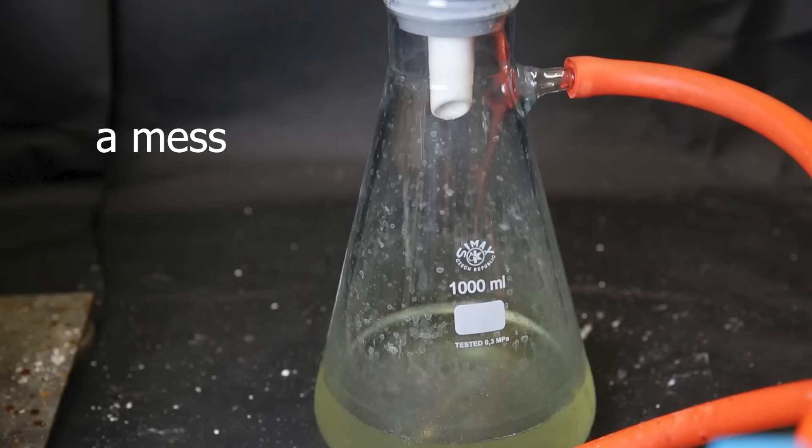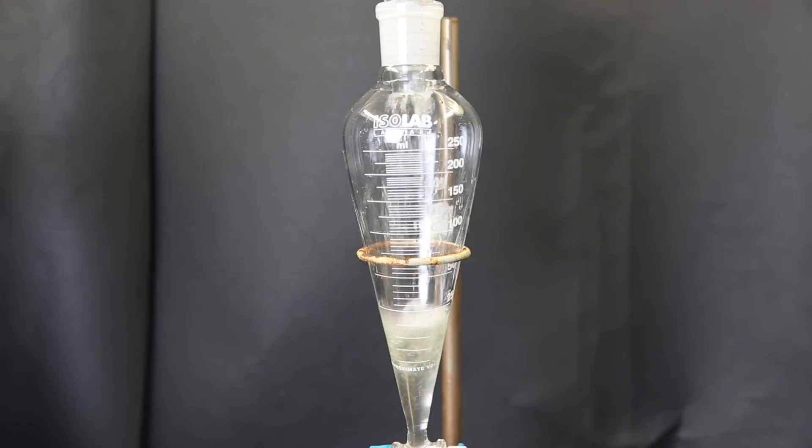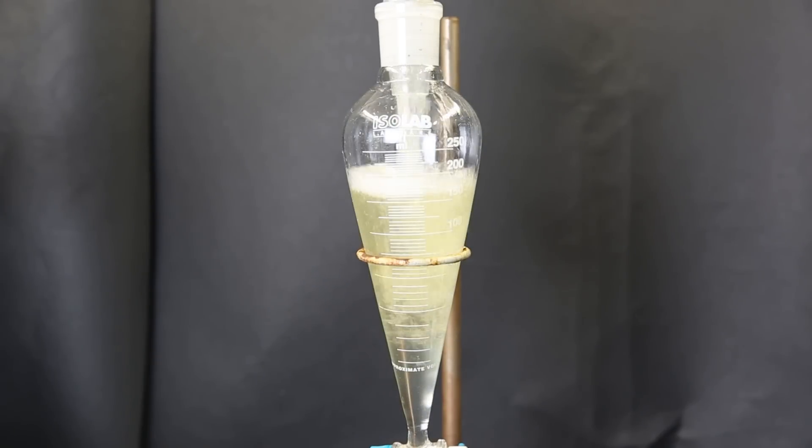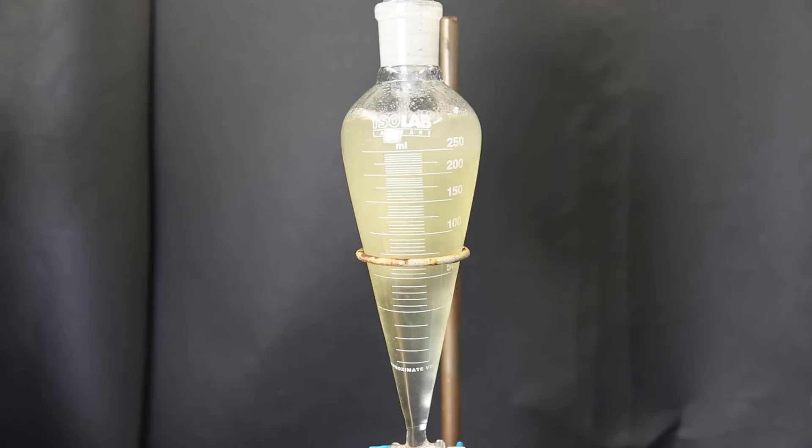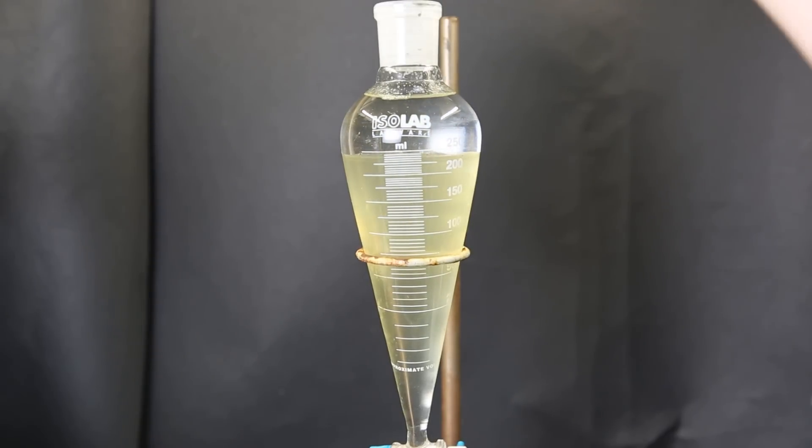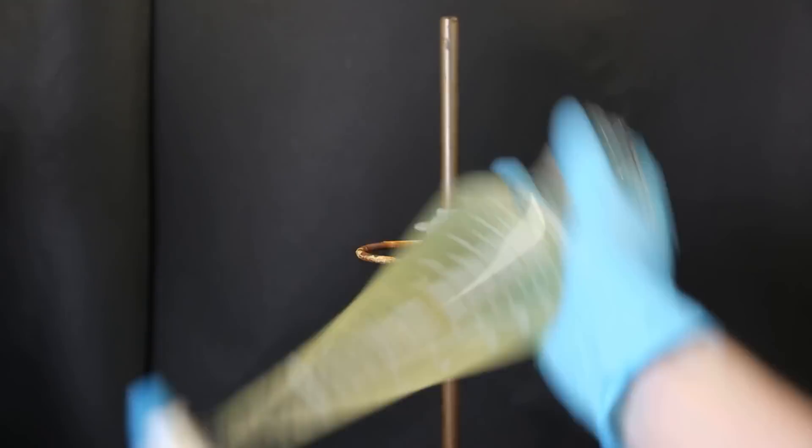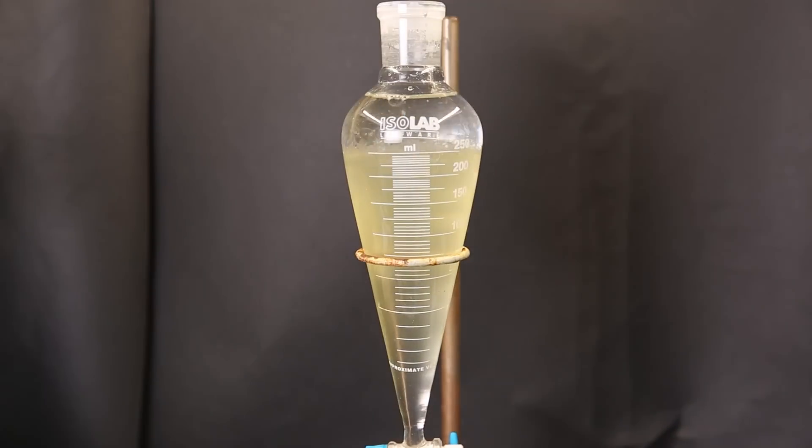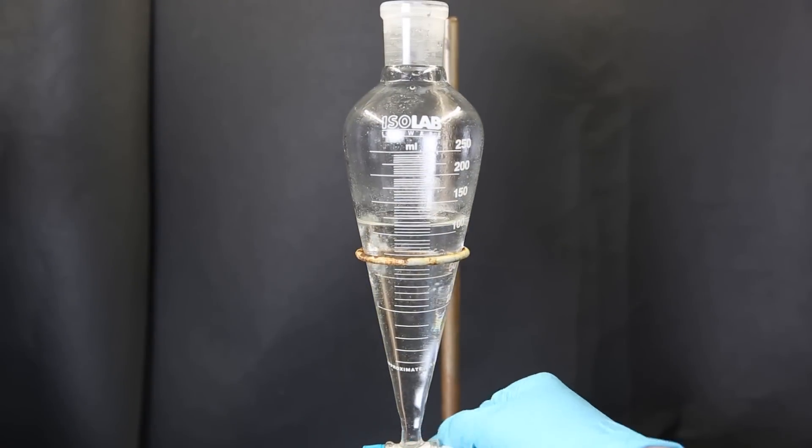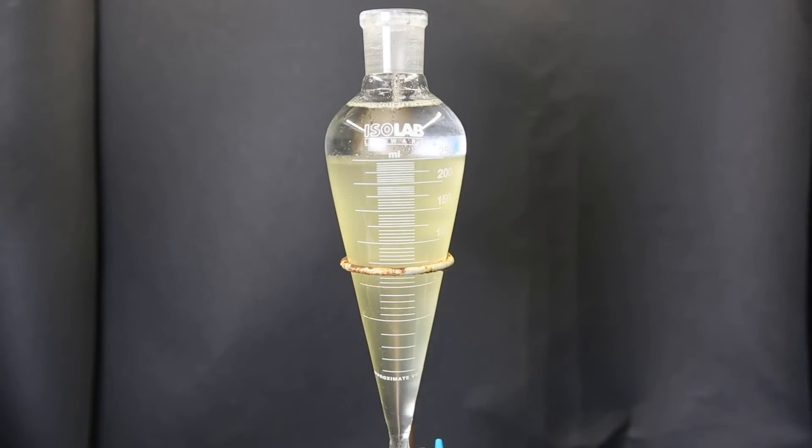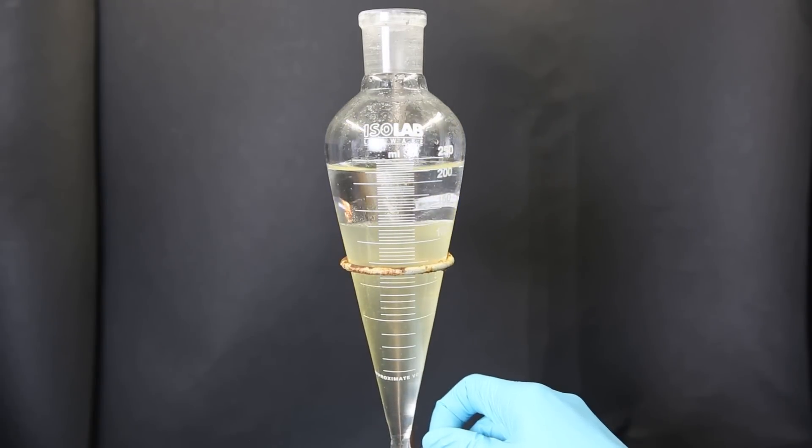Now I wash the filtrate multiple times with a saturated sodium bicarbonate solution. I shake the funnel and vent regularly, but there is no pressure buildup. After washing it several times with sodium bicarbonate, I take the organic layer again and wash it once with some brine. Then I collect the organic layer and put it into a beaker.